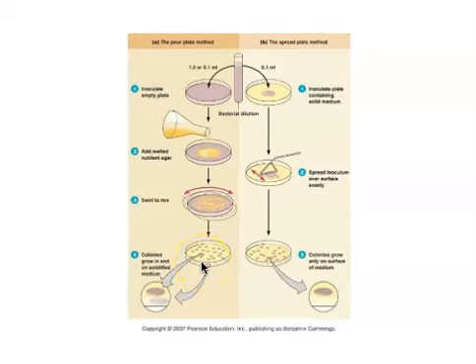The key is that if we have any cells in our original sample that cannot grow in room air because they have a sensitivity to oxygen, a pour plate will allow them to grow out of the air, either under the agar or in the agar. They will still produce colonies. It's just that the colonies won't be on the surface of the plate.